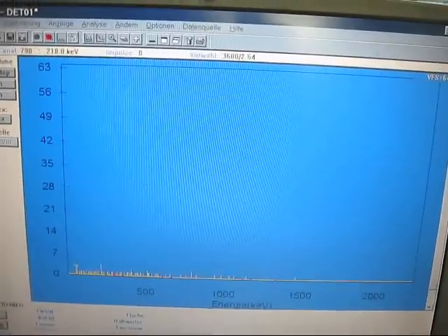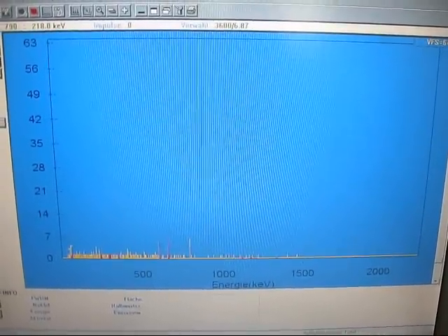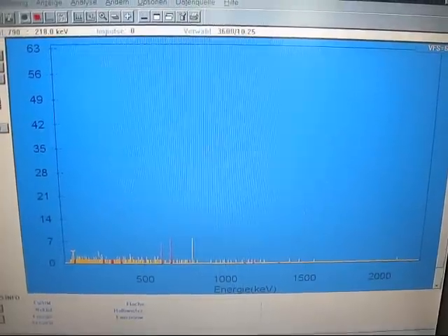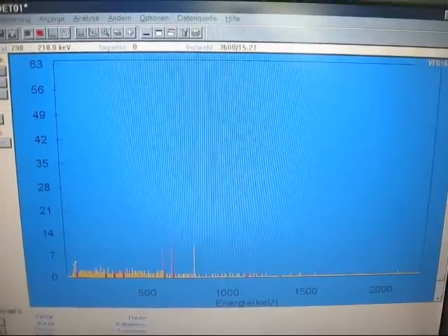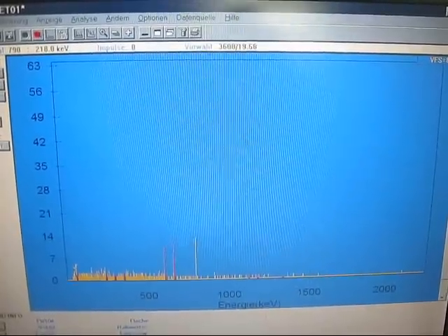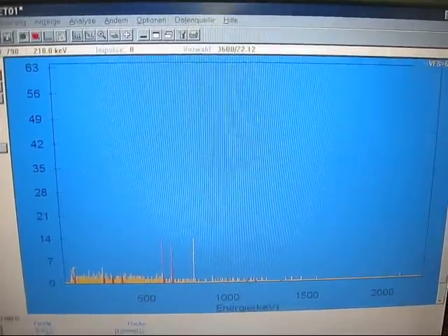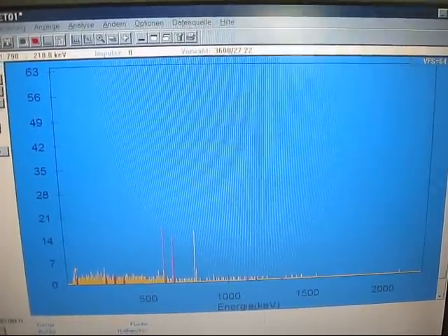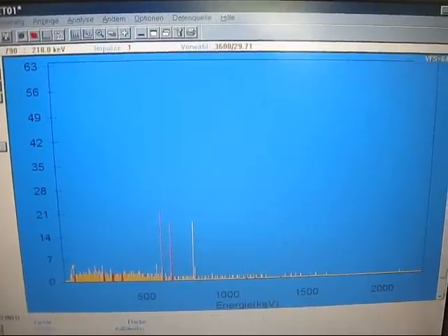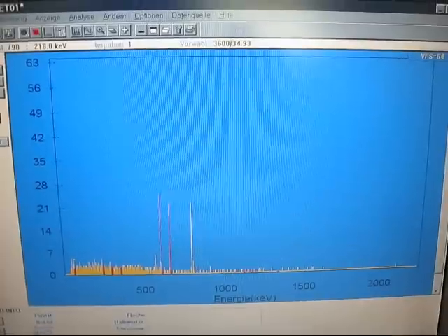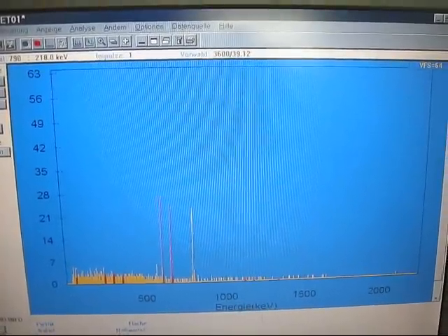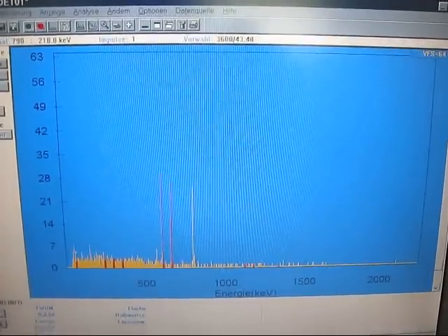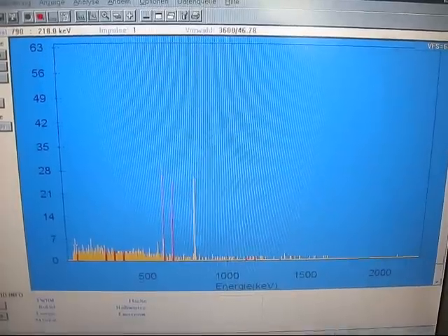This is the actual live view of the spectrum coming up. You can see on each channel there are incoming pulses. You can already make out a few of those peaks that stand out above all the others. Those are the gamma lines that actually belong to cesium-137 and cesium-134, which are very common to be around after catastrophes in nuclear reactors, and are not naturally occurring isotopes. They are clearly man-made isotopes that come from nuclear reactors. And you can see they stand out a lot. So this is quite a significant find.